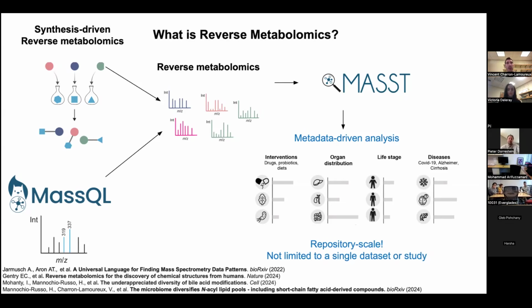So there are multiple ways one can obtain an MSMS spectrum. It could be in the supplementary materials of an article. It could be on one's computer. There are multiple ways that you can obtain an MSMS spectrum, or in different libraries or different databases.